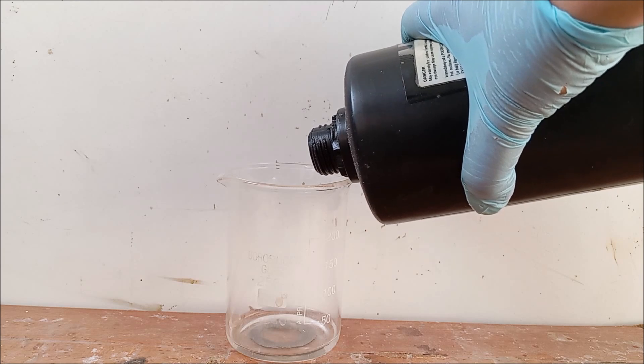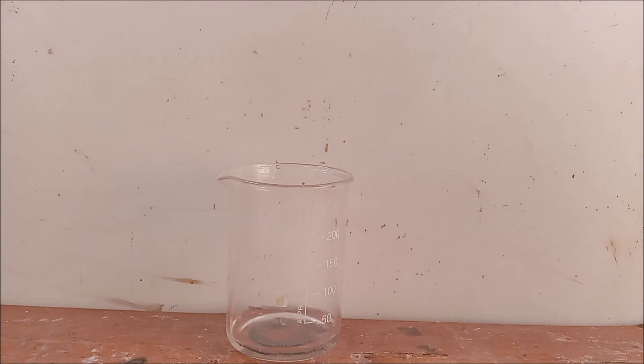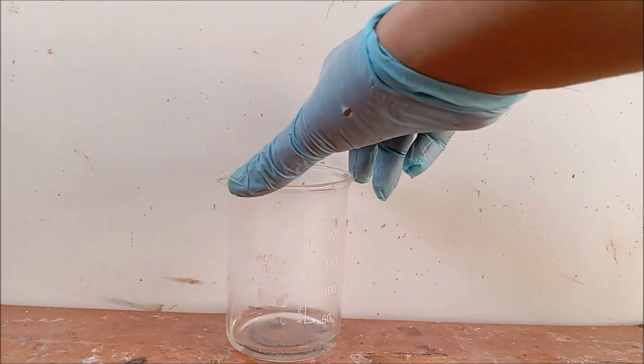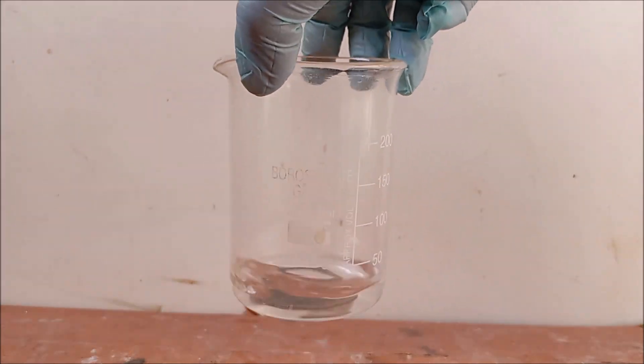To speed up the reaction a bit, add a few ml of hydrogen peroxide. This increases the speed of the reaction but not much. The strength of my 30% hydrogen peroxide has gone down a bit but it works.